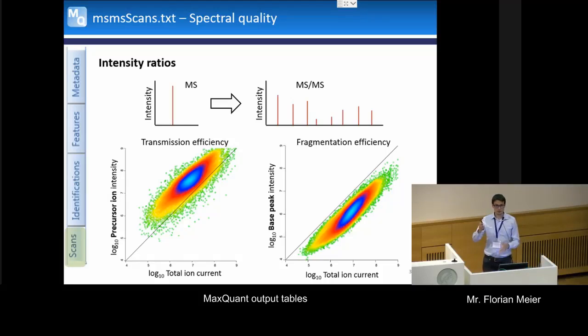On the other hand, if the base peak is very low, then you might have over-fragmented it. So this is another parameter. If this suddenly changes, then you know there is maybe something wrong with your HCD cell, because you no longer fragment, or you lost the fragmentation gas in the cell, or something like this.